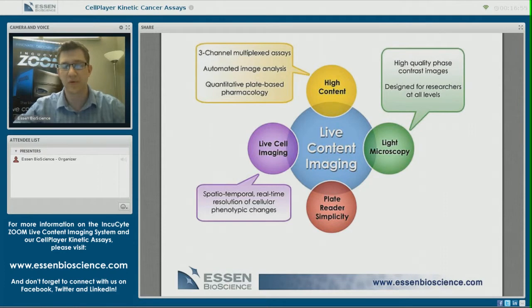Of course, to make this possible, you need to support several different vessels and manufacturing vessel types, plates, flasks, as well as slides and different tissue culture dishes.